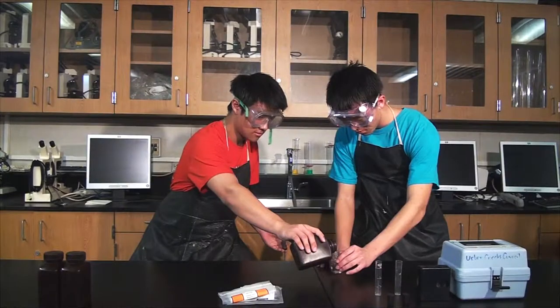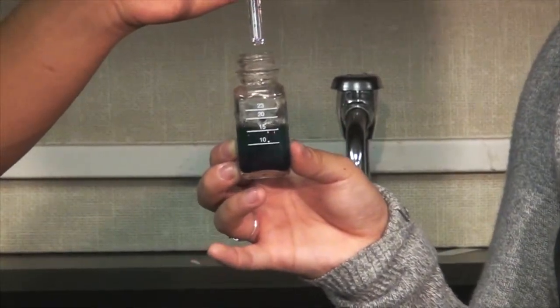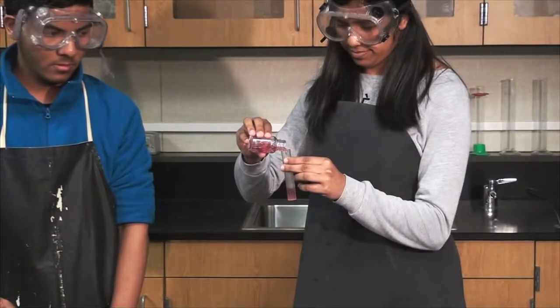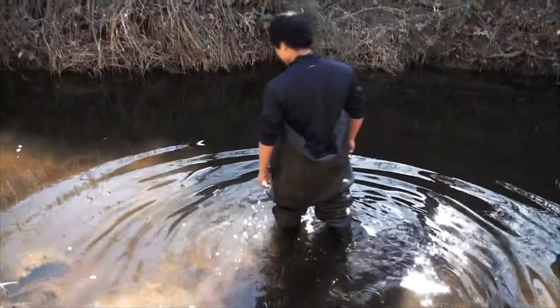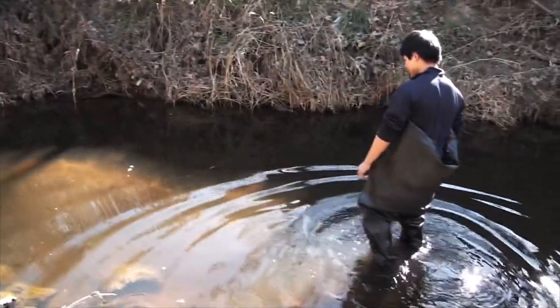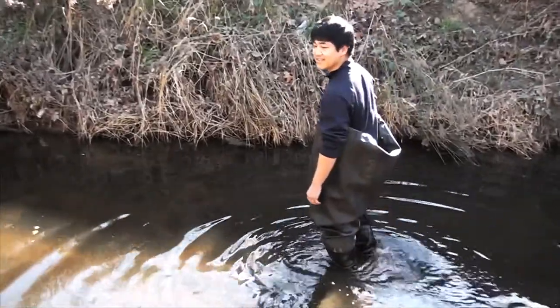These tests include dissolved oxygen, nitrates, phosphates, hardness, chlorine, ammonia, and alkalinity. The majority of the tests take place in the lab; however, the dissolved oxygen test must be performed on-site for the best results. This video will outline the procedures for two of the most important tests performed by the study.